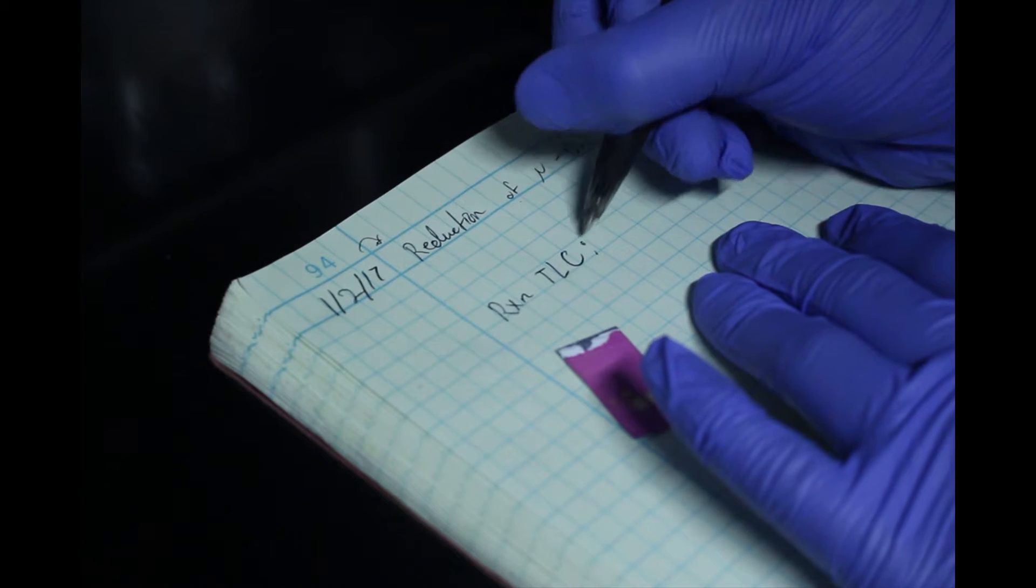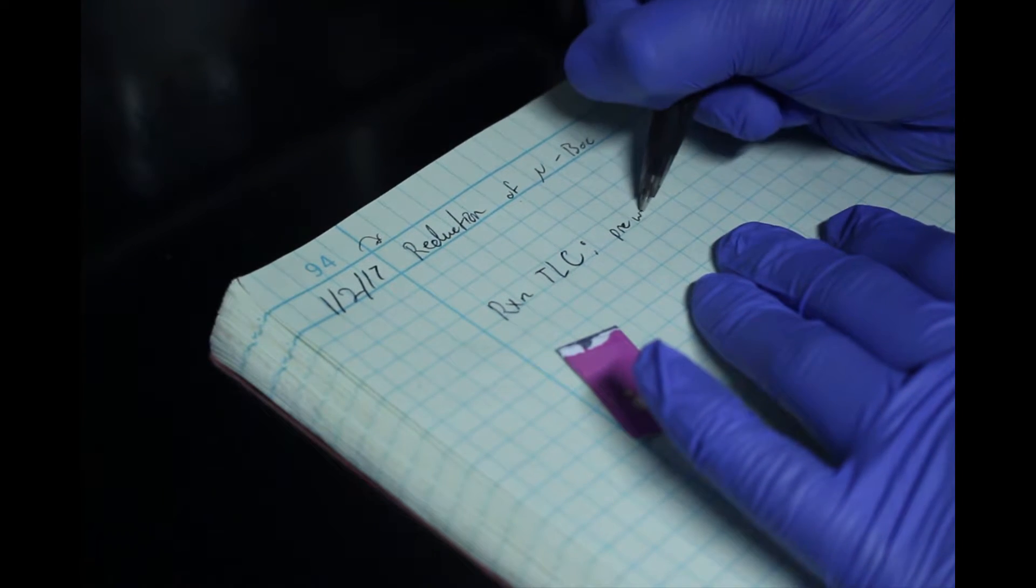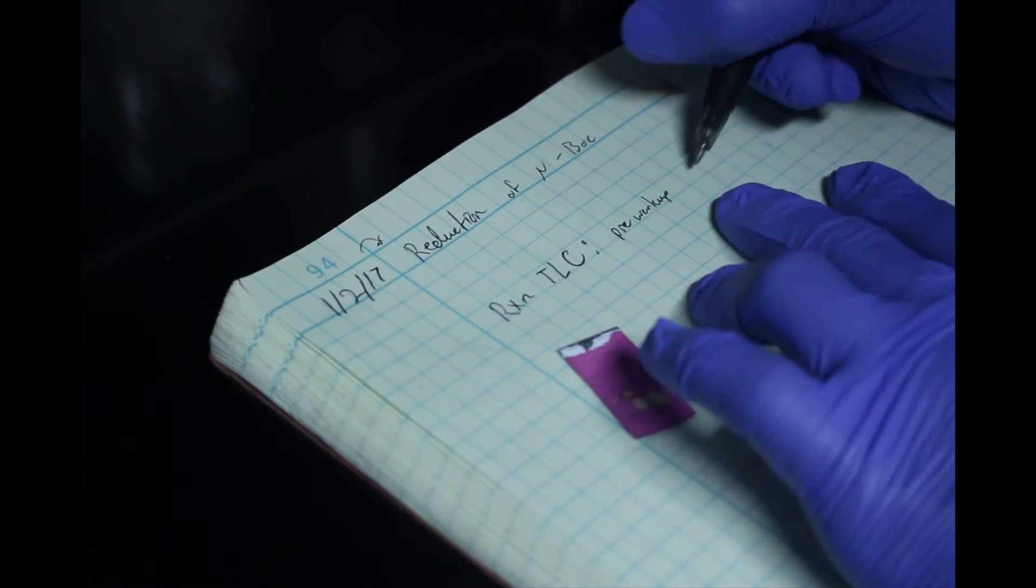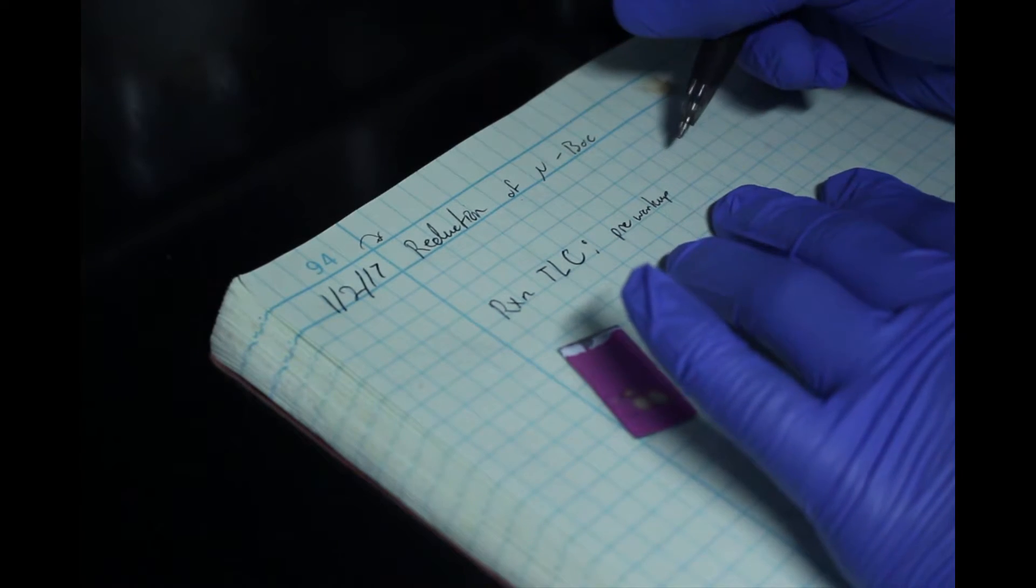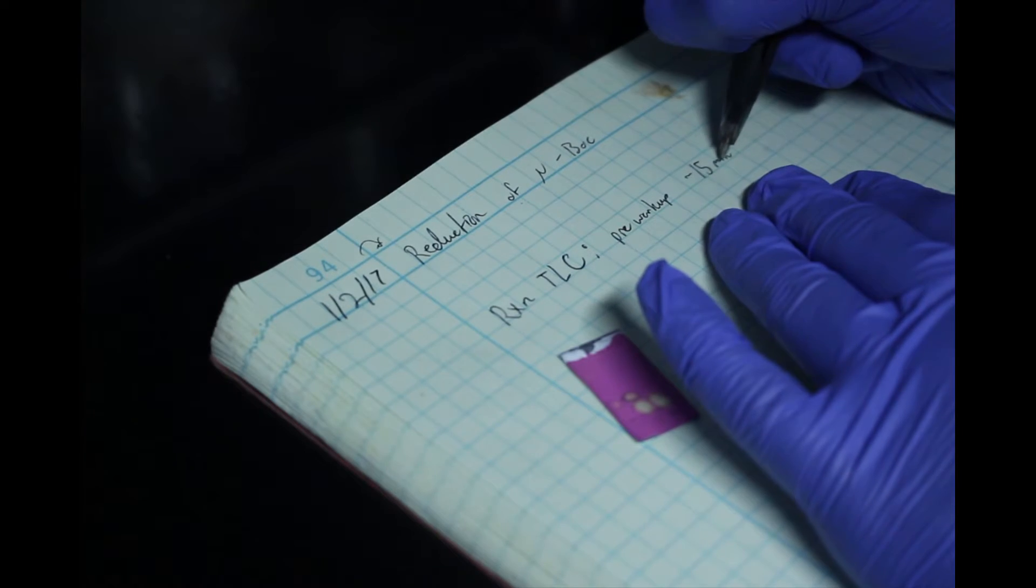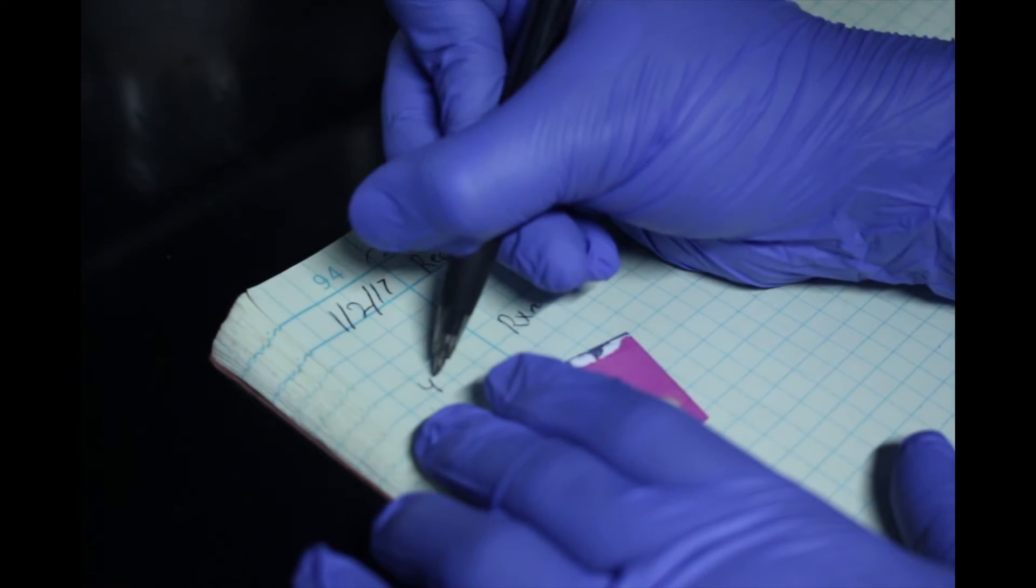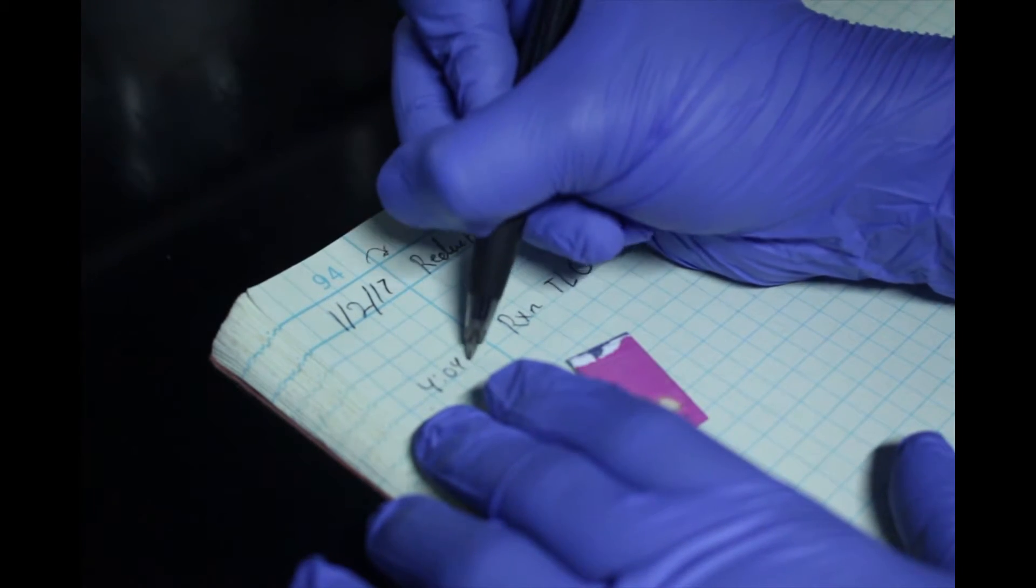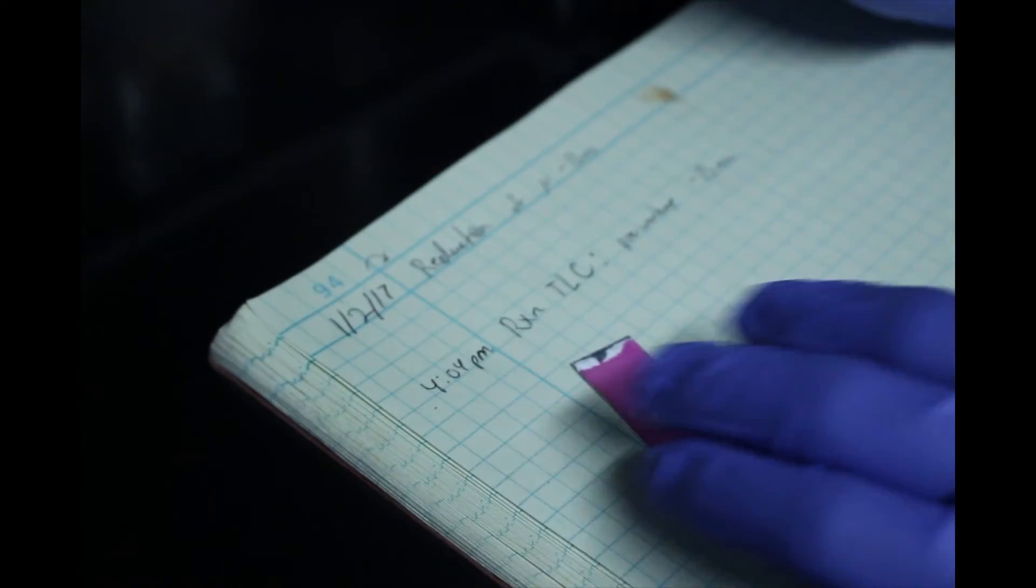Record the TLC plate in your notebook and interpret the results. If the spots are near the bottom of the TLC plate, the selected solvent system is too nonpolar. If the spots are all crowded at the top of the TLC plate, the solvent system is too polar. The goal is to achieve an ideal separation between the compound spots on the plate.